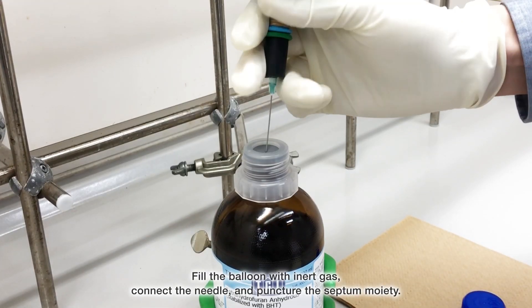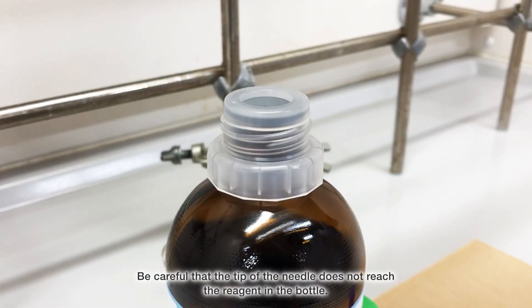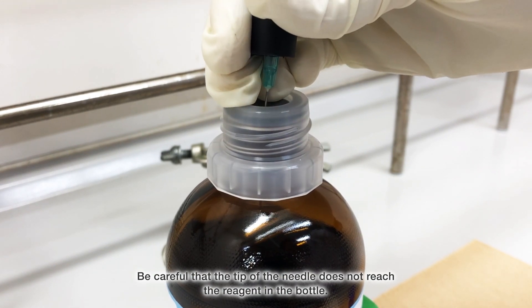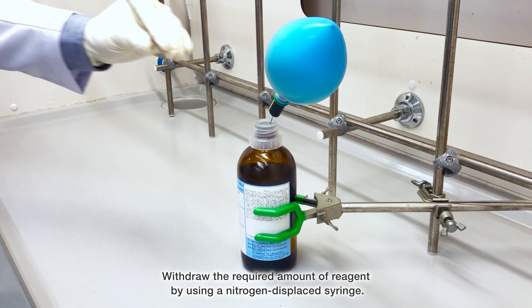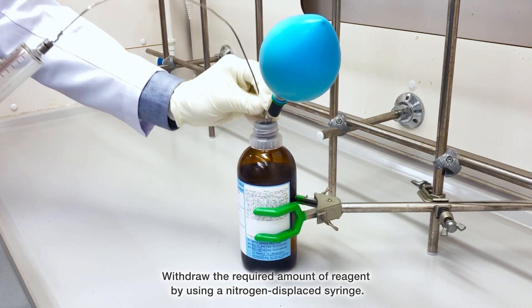Fill the balloon with inert gas, connect the needle, and puncture the septum. Be careful that the tip of the needle does not reach the reagent in the bottle. Withdraw the required amount of reagent using a nitrogen-displaced syringe.